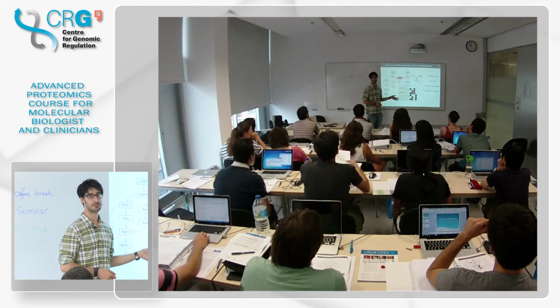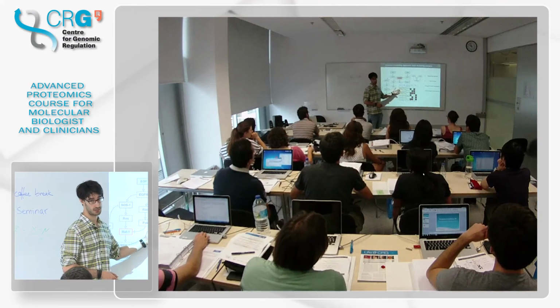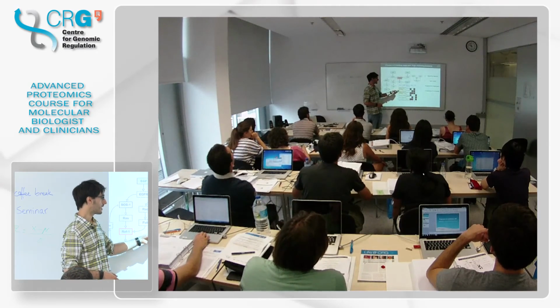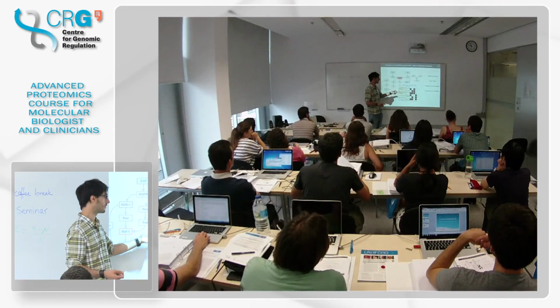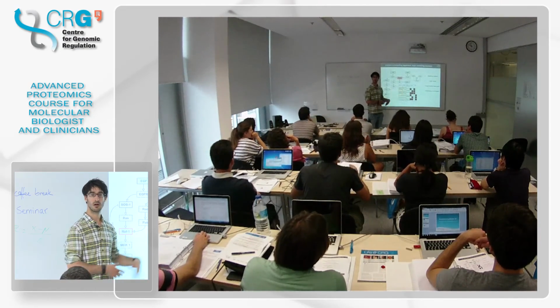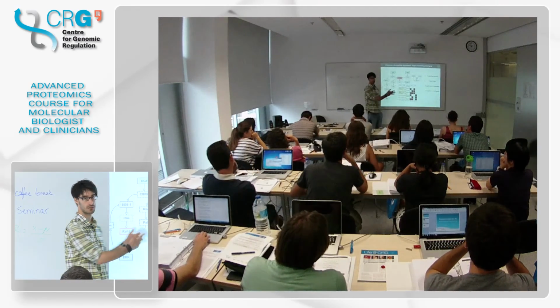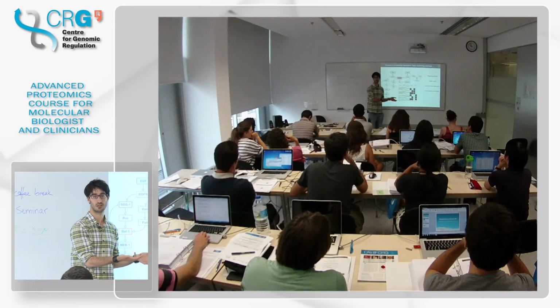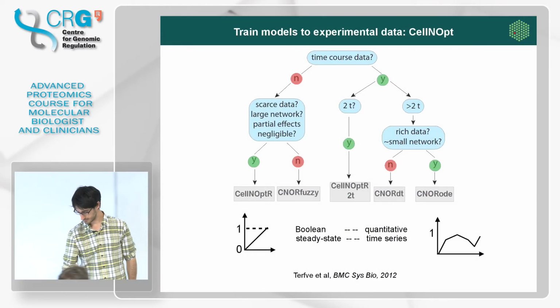We're going to see later, for example, the cases in which you assume a totally wrong network. In that case, you would see a red background here, telling you that the data is going up and down, and actually, based on the network that you gave me, I can only simulate that it's staying flat. So we're going to see how to infer that the assumption you made, your hypothesis, is completely wrong, and how to change it using an educated guess. Cool.